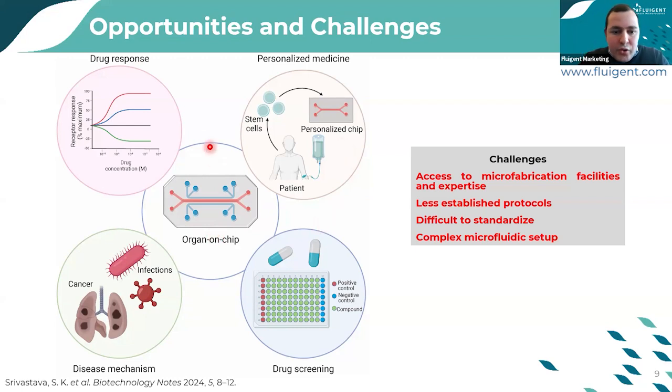However, in order to unlock all these advantages of the organ on chip, some challenges remain in terms of instruments, or how to do the setup and integrate it in your lab, such as the access to microfabrication facilities and expertise if you want to create your microfluidic chip or your microfluidic model.